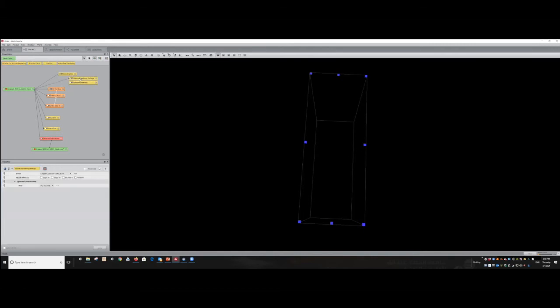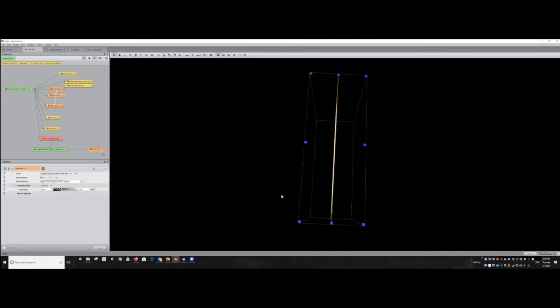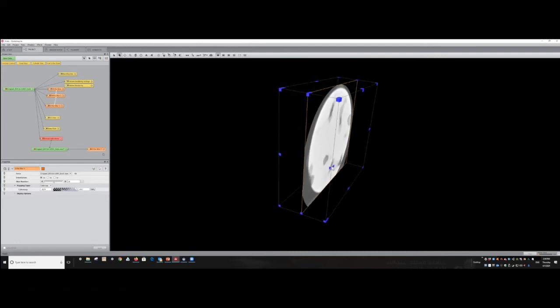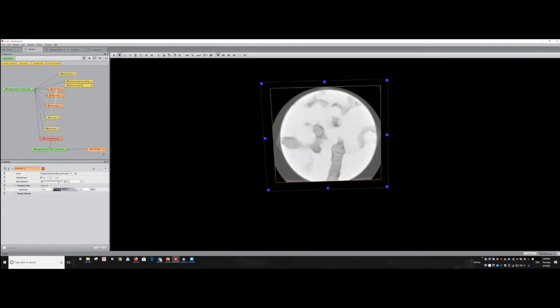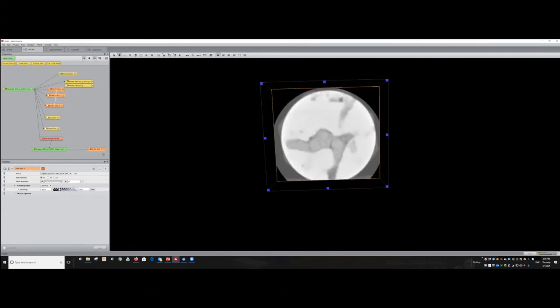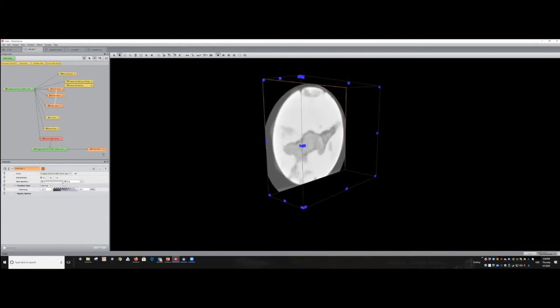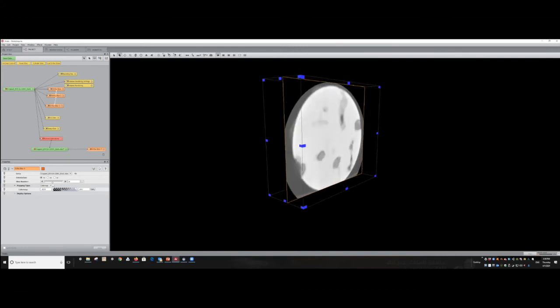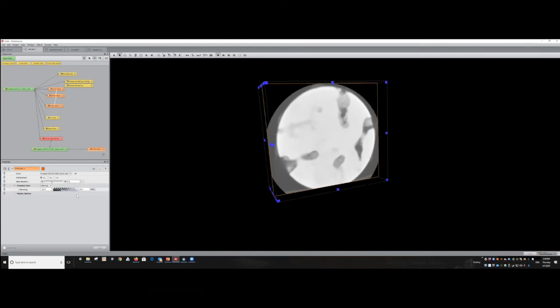I'll hide the volume because this volume renderer is attached to the original rock sample. So with the new cropped one, I'm gonna click on and get a new ortho slice here. And this is the region that I cropped. So let's say that this is what I want to segment, just this part, work on it, label the objects. Again, I can change the range.